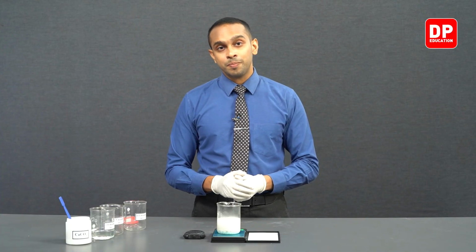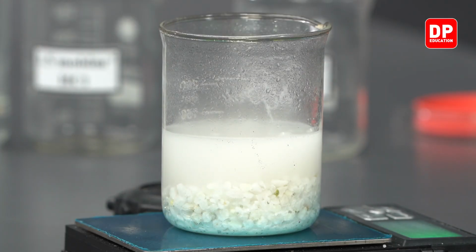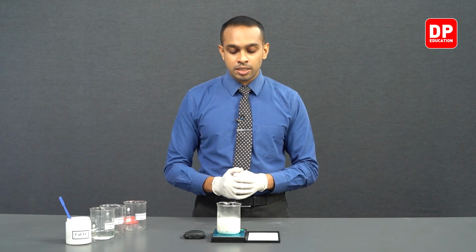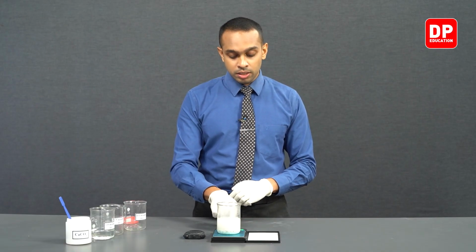So as you can see, when you react HCl and calcium carbonate together, they will react to produce carbon dioxide. Calcium carbonate, when reacted with HCl, will release carbon dioxide. You can see carbon dioxide gas is emitted. You can see the bubbling of this reaction mixture, and as it bubbles, you can see how the mass of the entire reaction mixture reduces.